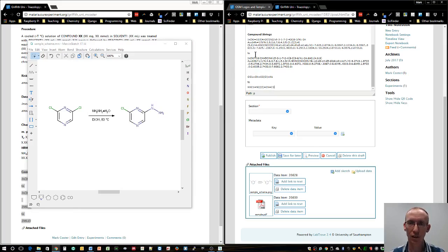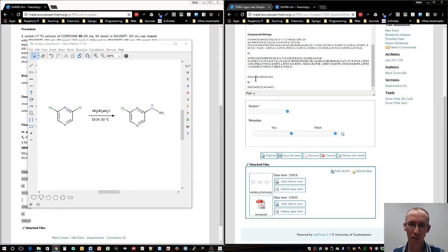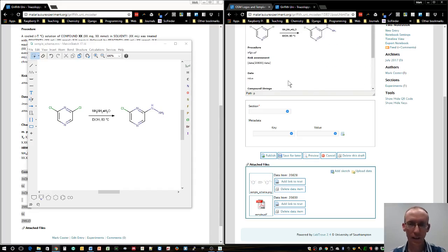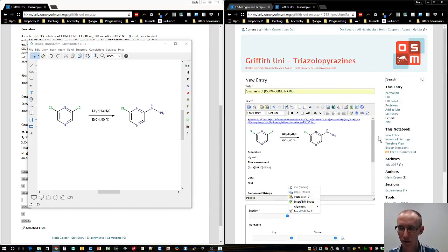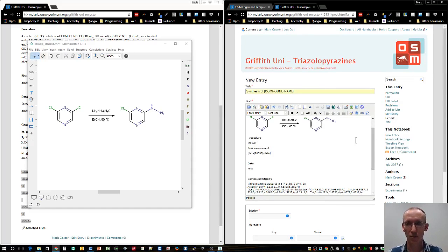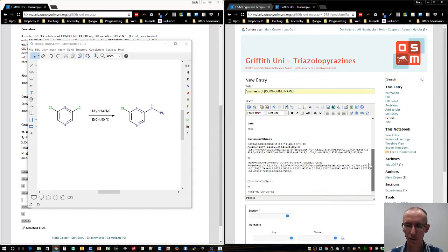So now we've got this INCHI going to product INCHI, and the starting material SMILES string going to this product SMILES string. That's about all I wanted to show you as far as entering the information into the electronic lab notebook entry.